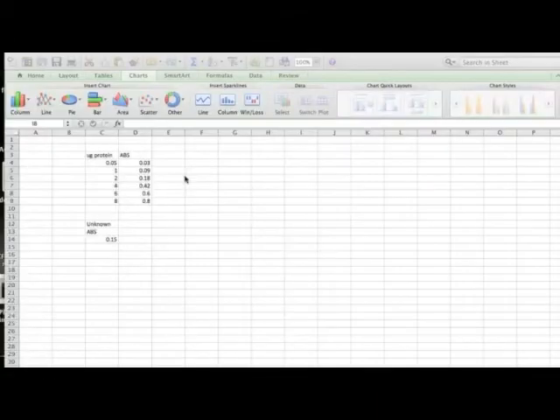Alright, so you've done the experiment where you've measured the absorbance of your protein samples and you want to graph that relationship between the amount of protein and the absorbance in the spectrophotometer. Then, with that information, we can figure out what our unknown samples are. But first things first, you gotta make the graph.